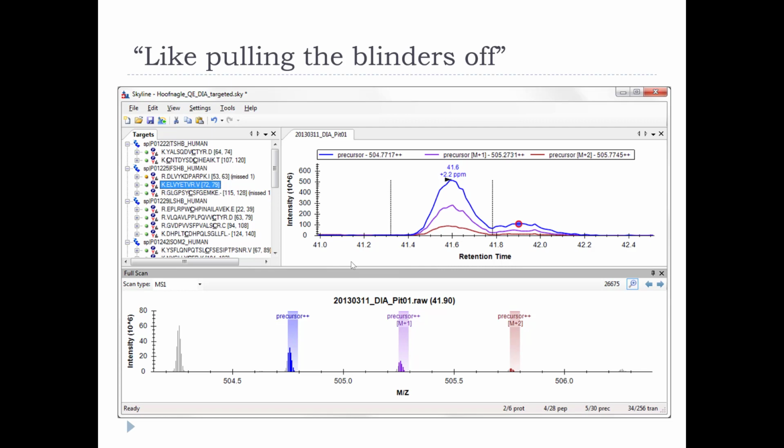Actually, since it's doubly charged, right? It's doubly charged. It's a 2 m/z change. That's what... no, it's 1, sorry, because that's a half. Okay, so anyway, but it's not as well centered.